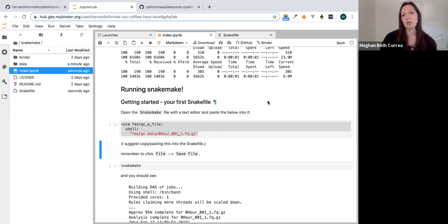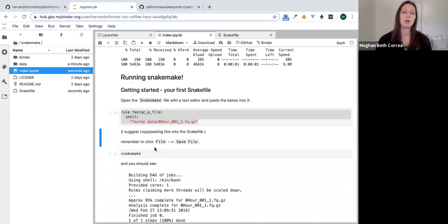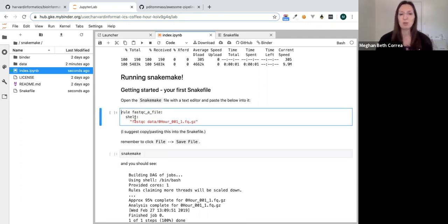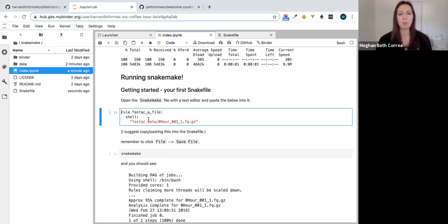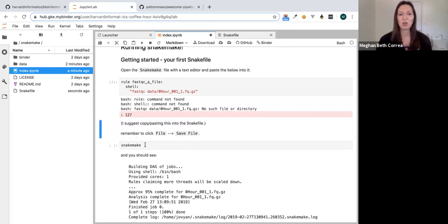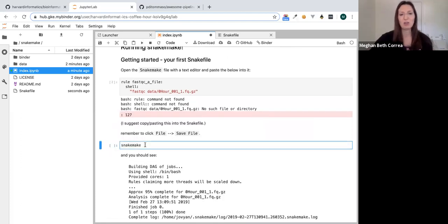This notebook is using a bash kernel so we can run the Snakemake command in it. One thing that might be confusing is that the code blocks you'll be cutting and pasting into the Snakefile are not bash — they're Python with extra Snakemake syntax. So if you try to run those cells you'll get an error. Basically all we're going to be running is just Snakemake, Snakemake, Snakemake.